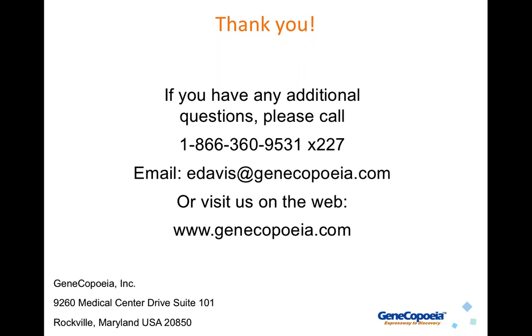Okay, next question. Is it possible to make sure Cas9 cuts the target sequence only once and that the plasmid is not integrated in the genome, thus increasing the rate for off-target effects? Yeah, like I said, it's very important to do the screening methods that I mentioned before. Cas9 will not cut the chromosome anymore once it has made the cut if you get NHEJ. And if you are using a donor clone, then by all means, please do the double junction PCR method that I mentioned earlier for screening for correctly integrated clones.